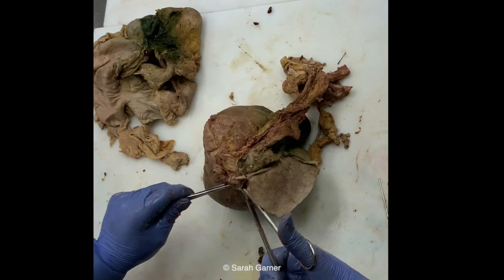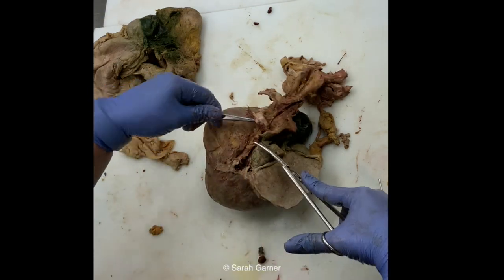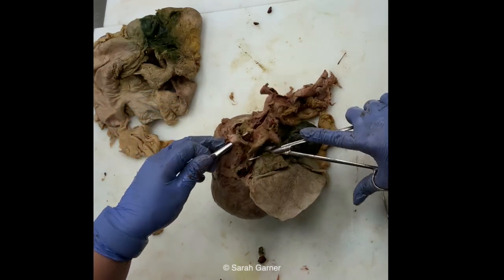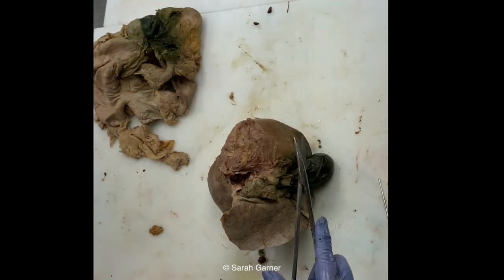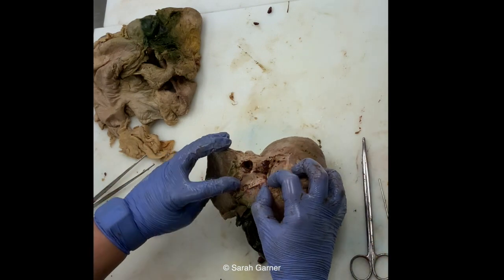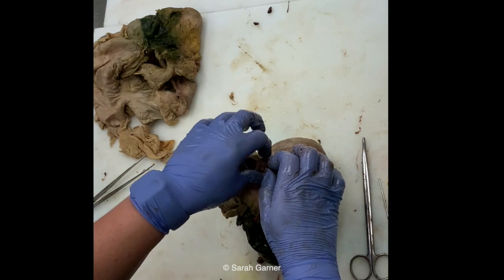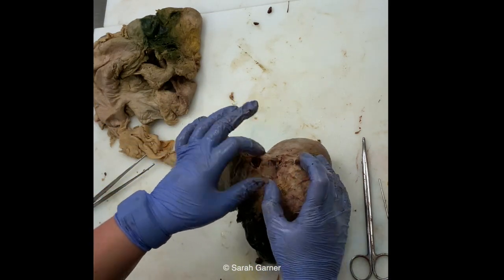Trimming off the top of it here. So this right here is where we cut it, just above the diaphragm, like right where it's entering the heart. So I'm cutting off the vast majority of it here, and I'm leaving just where the openings, those hepatic veins, are draining into it. So that's a little bit of the IVC left, and these are both hepatic veins that were draining into the inferior vena cava. So those two openings, that's what those are.